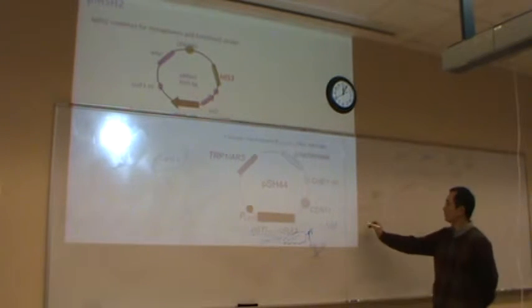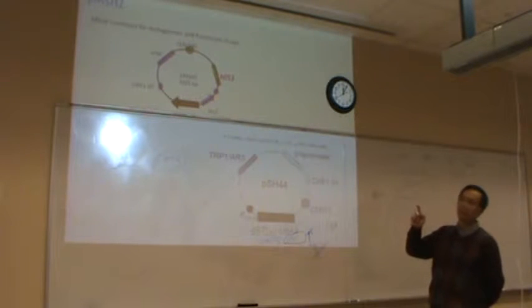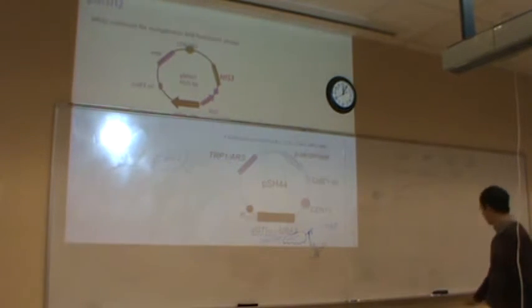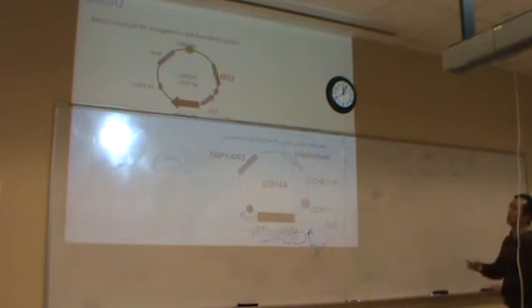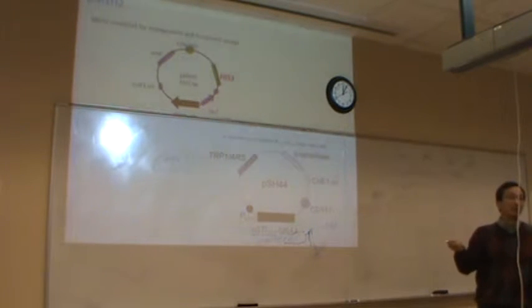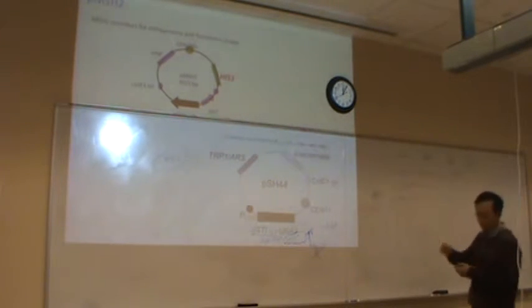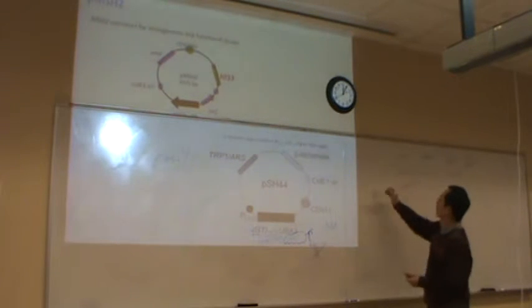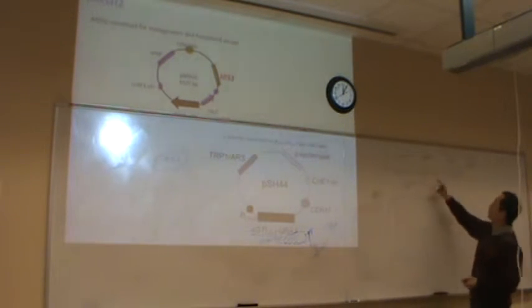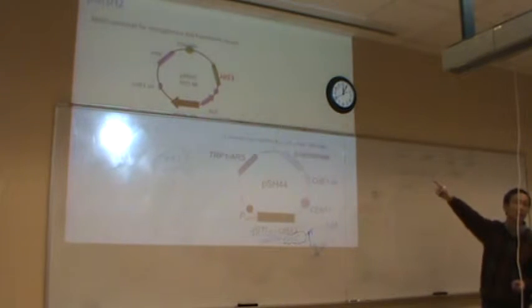Yes, the vector. Because if we really put in a blank, that means we will miss the plasmid, and the cell basically won't live. Because the FOA plate is minus tryptophan minus histidine, it has to have the histidine marker to live.